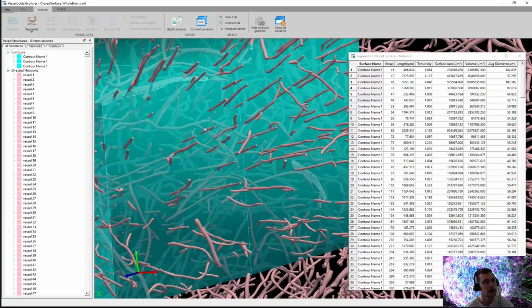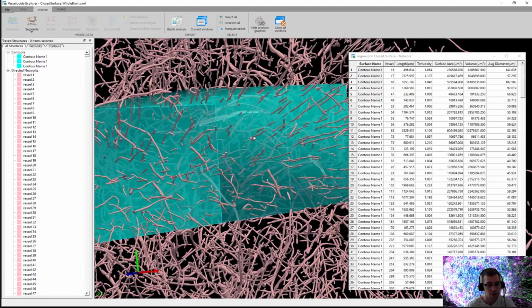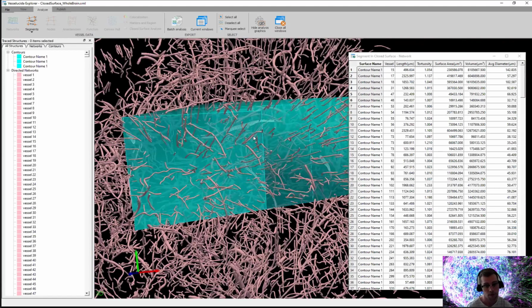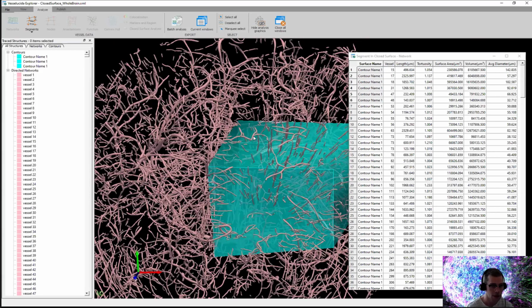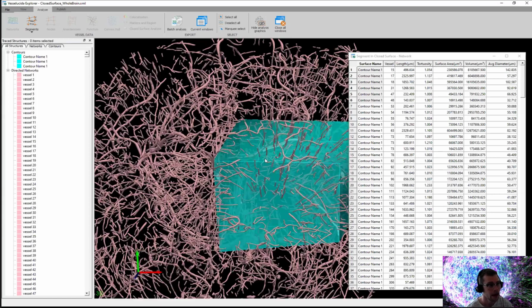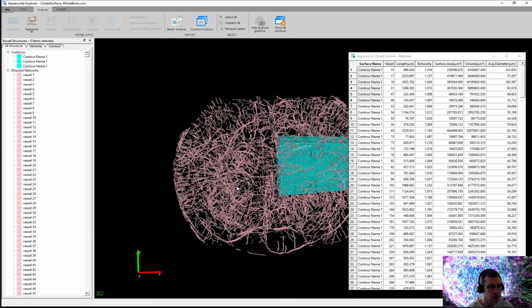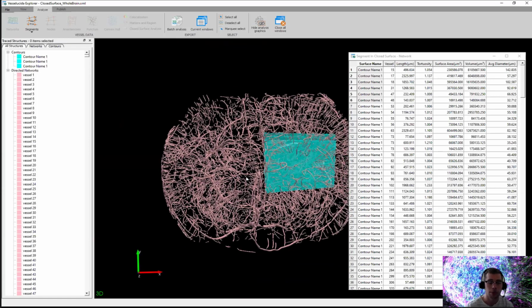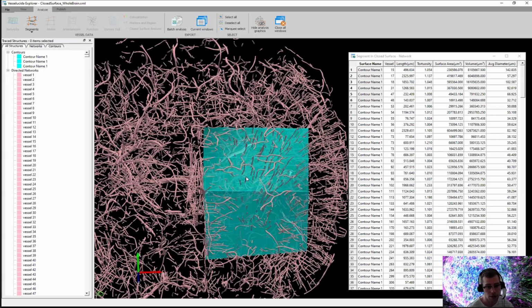And then when you get here into Vesselucida Explorer, you can really look at those segments and look at that region with a more developed, more in tune and more accurate measurement rather than having to parse it out on your own. That is a really wordy explanation, but there are a couple of different ways that you can work without having to break your data into chunks.